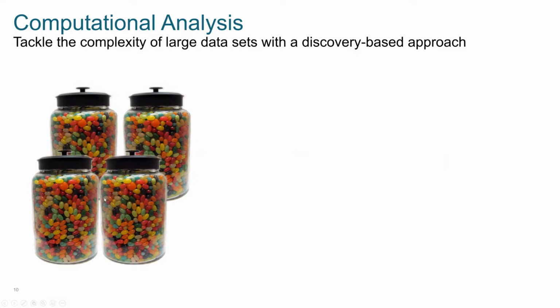And there's maybe 20 different flavors in each of these jars, but I want them to identify the jar that has the most of my favorite flavor, which is the bubblegum flavor. Okay, so you're going to have to go through each of these jars, sort them all out, divvy them all up, and count the frequency of that bubblegum jelly bean, and tell me which one had the most. Okay? And also there might be a mystery flavor in there. And I want to know how many are of that one as well.